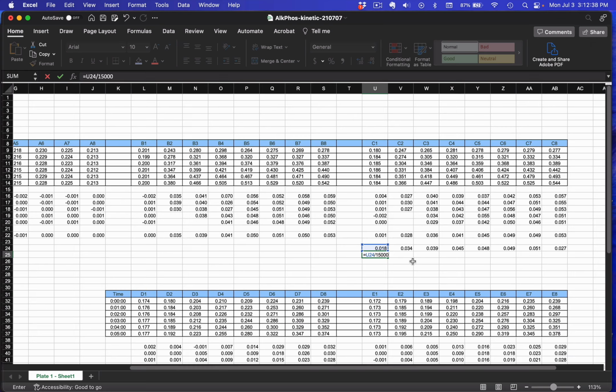We've got a volume of 200 microliters, so we take that 0.28 and multiply it by 2.5. So we end up with 0.7 for a path length. So we divide by our extinction coefficient, and then divide again by 0.7 centimeters, and that should convert this into a concentration.